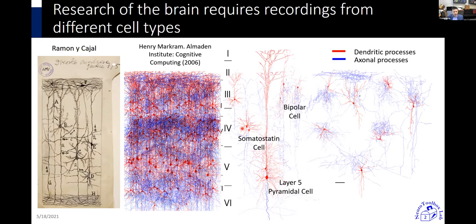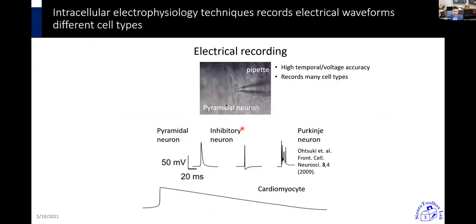Okay. So neuroscientists also like to look at function. Traditionally, people have examined neural function by actually poking neurons with pipettes, making actual physical contact. This is the first neuron I ever patched in slice, but you put the pipette on there and you can measure the action potentials, these spikes of activity that are integral to the communication within the brain.